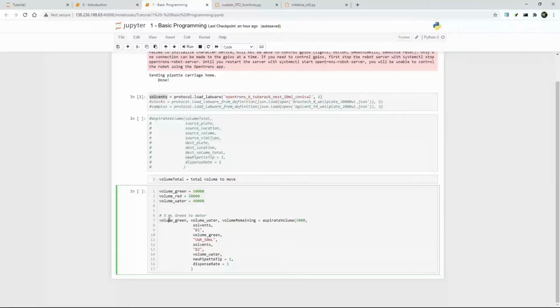And it'll set that there. So now this will be 45,000. And when we do it for the red, it'll be the same. However, you're adding that 5,000 to the water, so this will go from 40,000 to 45,000 to 50,000. Right? And we'll get into more detail about that later. This is just a way of tracking this. Okay?